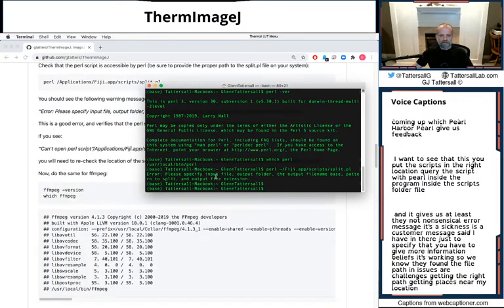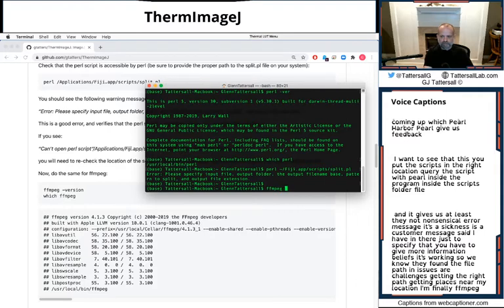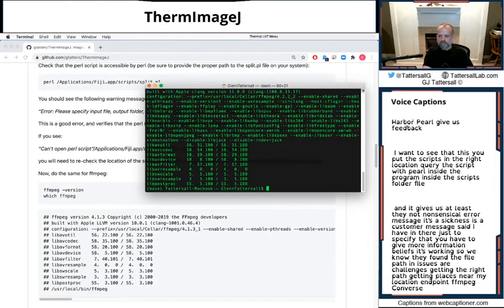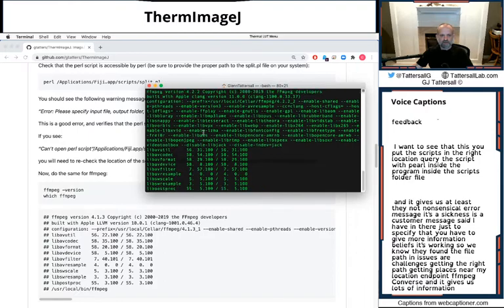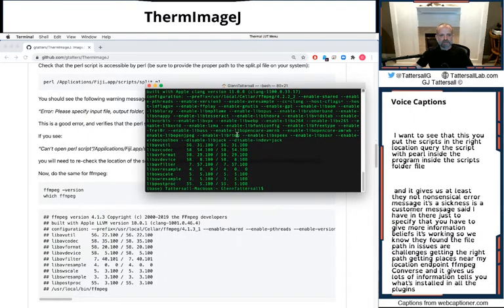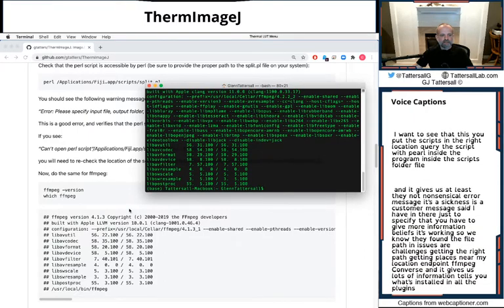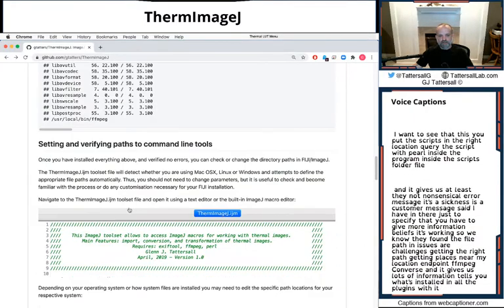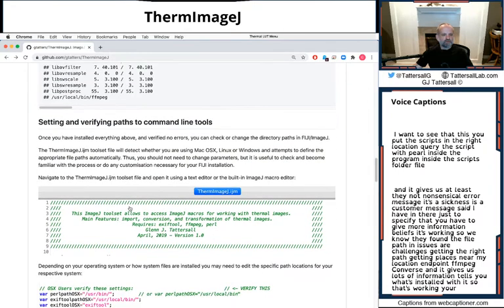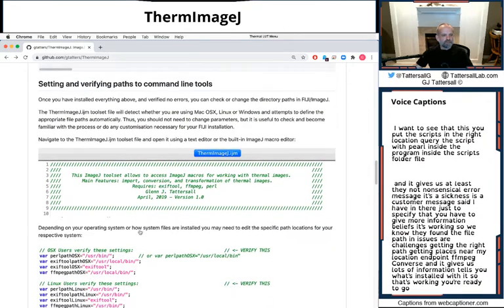And then finally, ffmpeg -version. And it gives us lots of information. It tells you what's installed and all the plugins that they've installed with it. So if that's working, you're ready to go. So you launch Fiji.